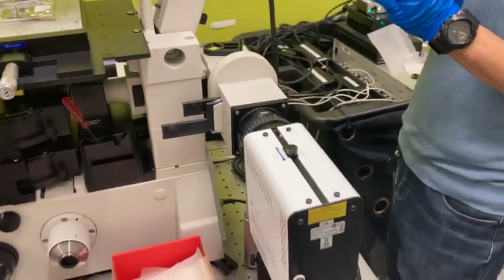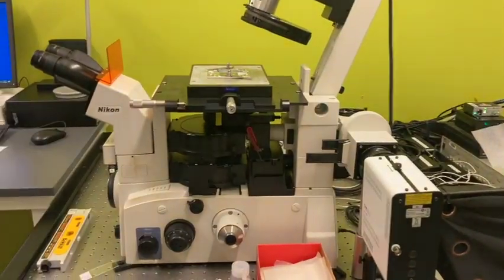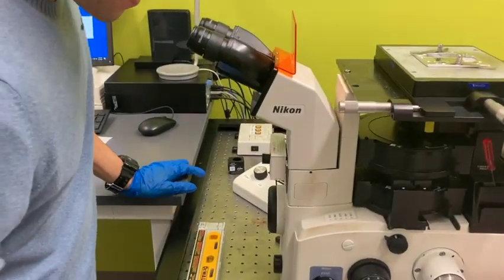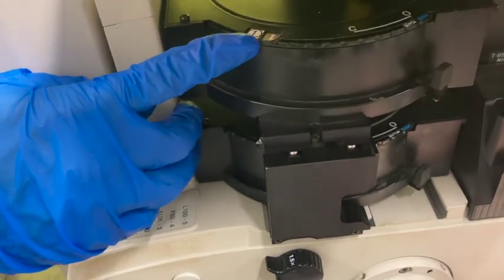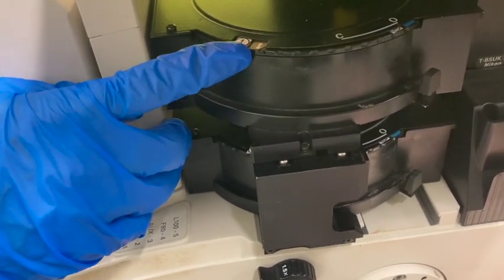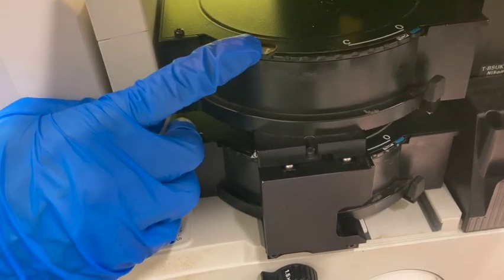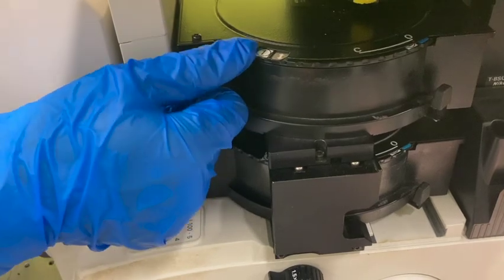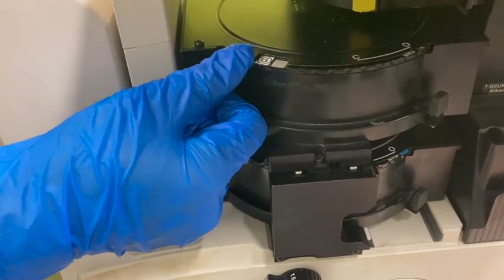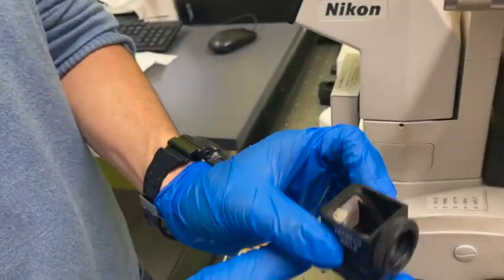And then we have our filter sets. This top we always set to 1. If I get it out here, what's inside is something like this.